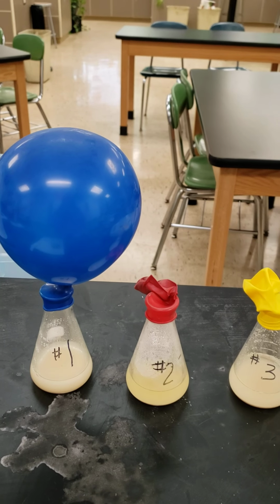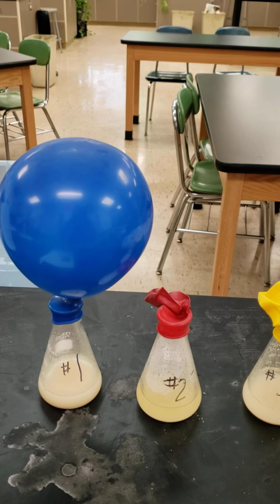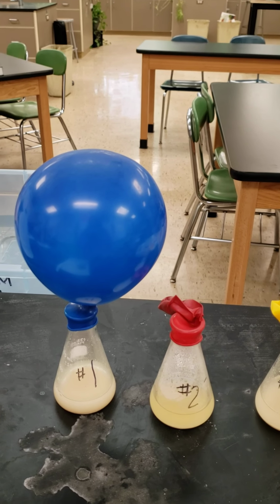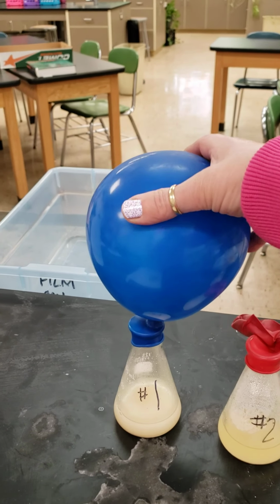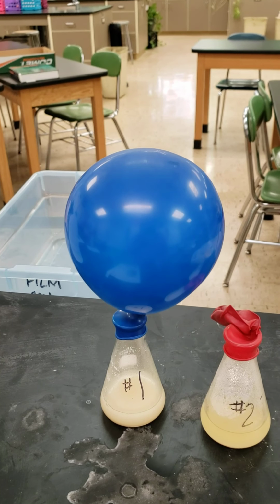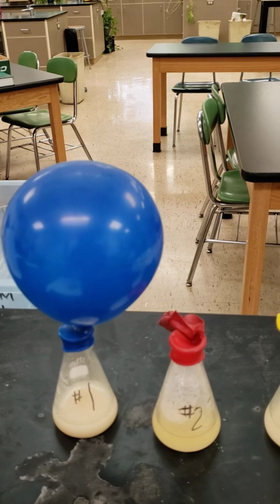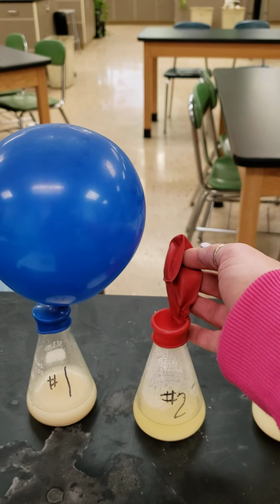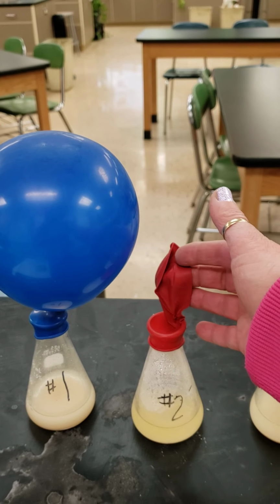All right, so did flask number 1 do cellular respiration? Did it produce a gas? Well, it looks like it did. Did flask number 2 do cellular respiration? Did it produce a gas? Nope.